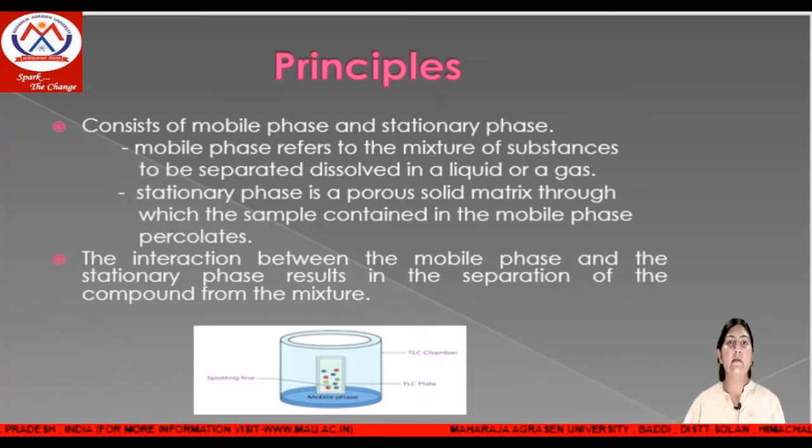Here is a figure which shows the separation through TLC, which is thin layer chromatography. It is also a chromatographic technique which is used for the separation.